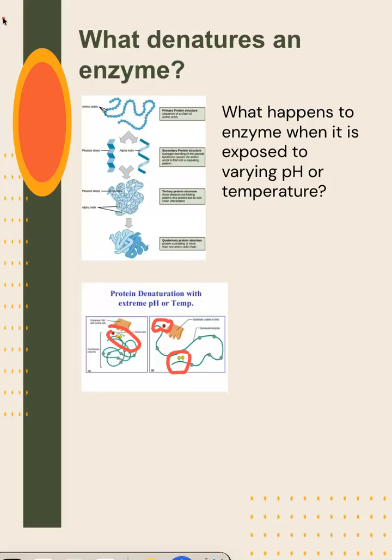And the last experiment, which is not in your lab manual, but I'm going to demonstrate to you, is just looking at how we can detect pH.